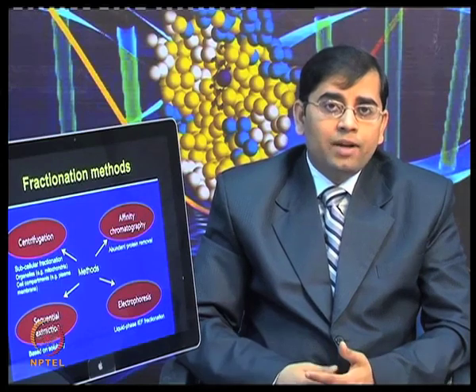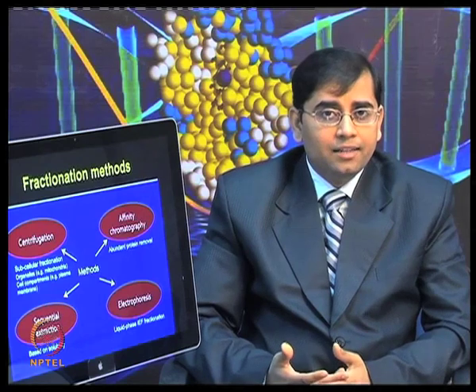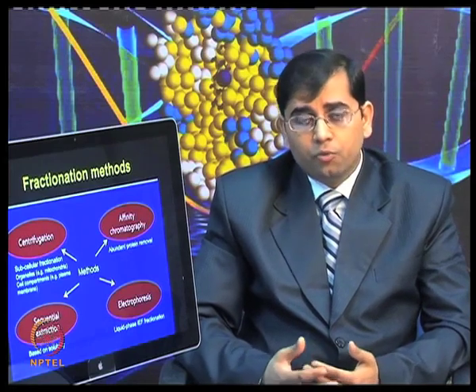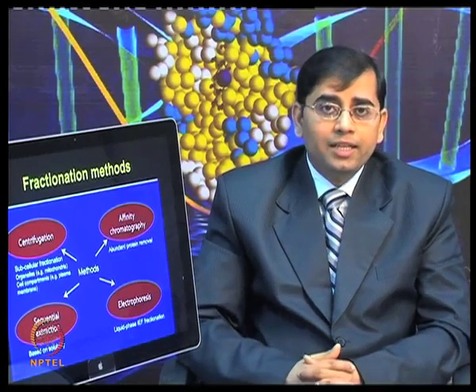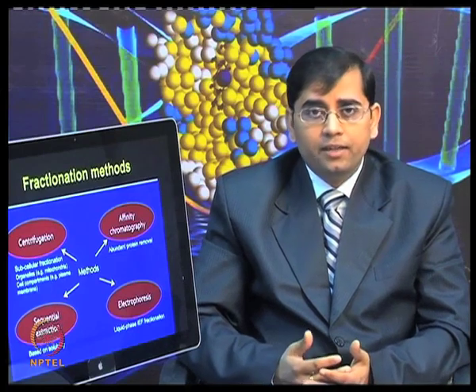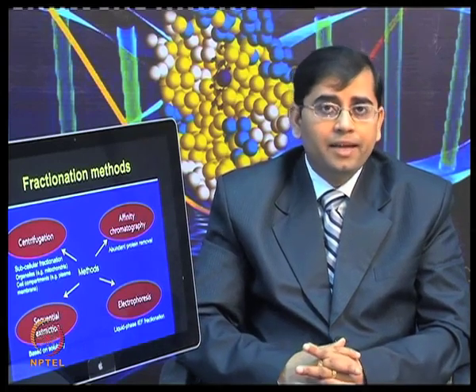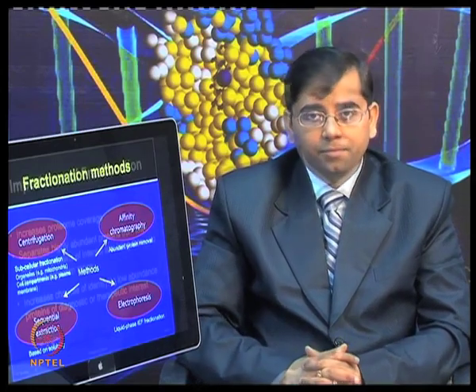In the next lectures, when I talk about specific gel-based and gel-free techniques, I will describe a newer method called off-gel fractionation, which simplifies separating proteins based on their isoelectric point in liquid phase. One can collect fractions of different pI ranges and then perform the proteomic analysis.